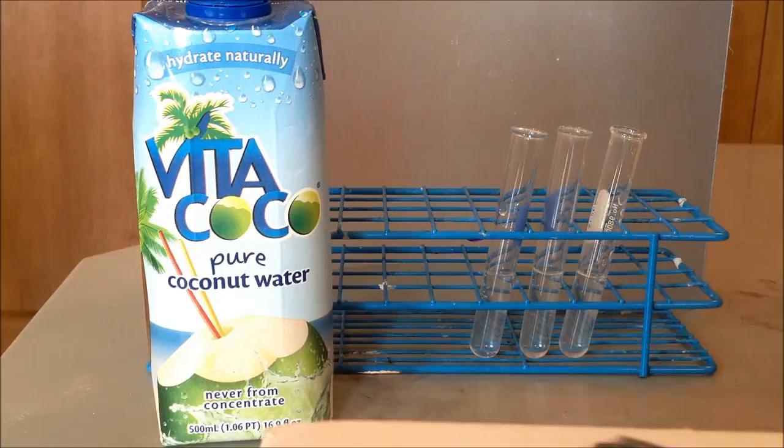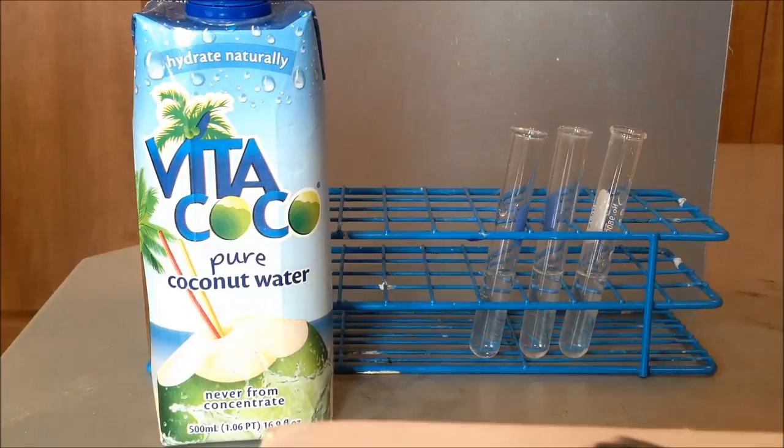Here's the coconut water — you can make your initial observations. Here are the test results for the coconut water. The first one is Lugol's iodine, then we have our Benedict's, then the biuret, and then the lipid test.